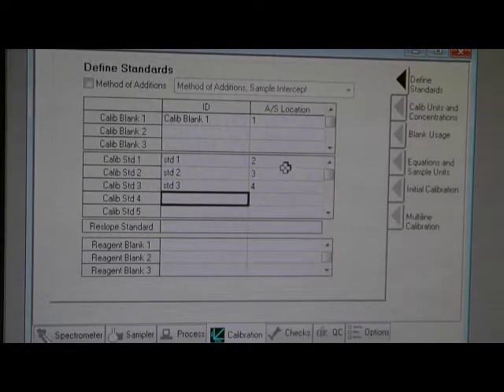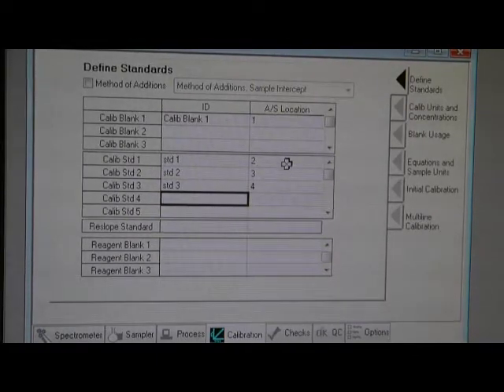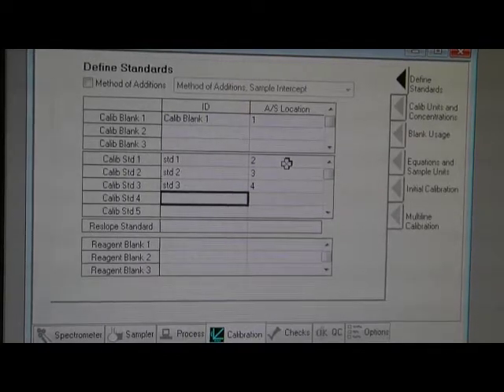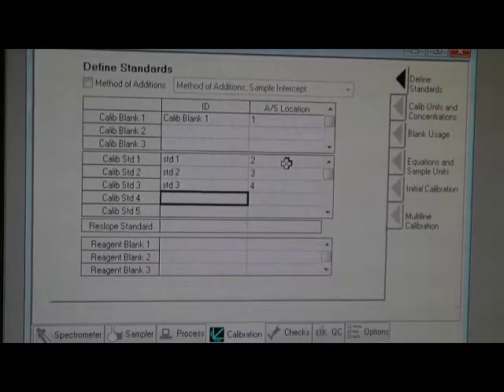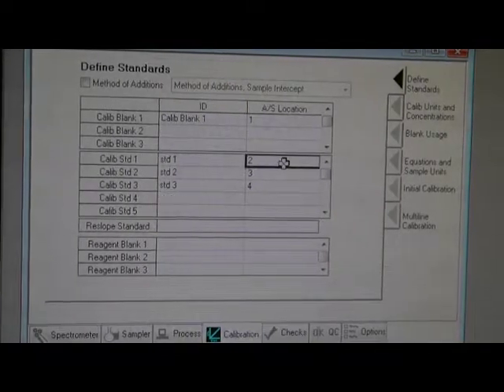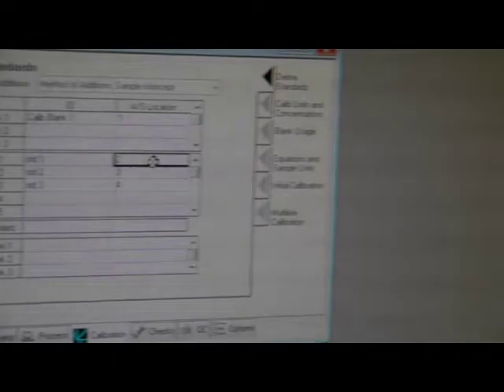The location depends on where you want to put your sample tube. I will choose one of the numbers that I normally choose from the line.